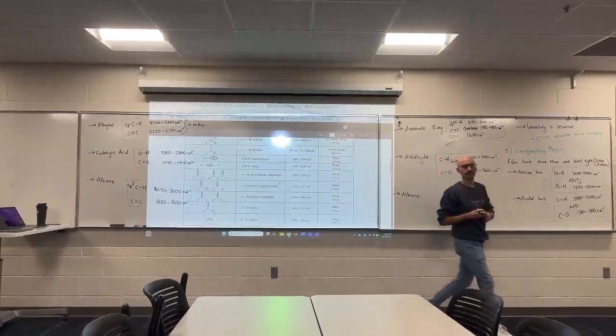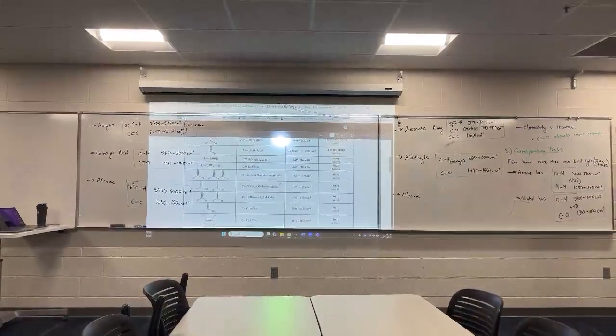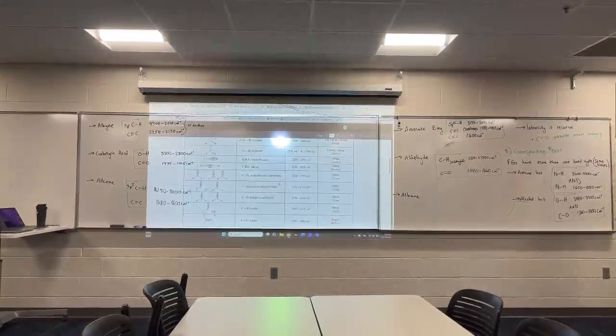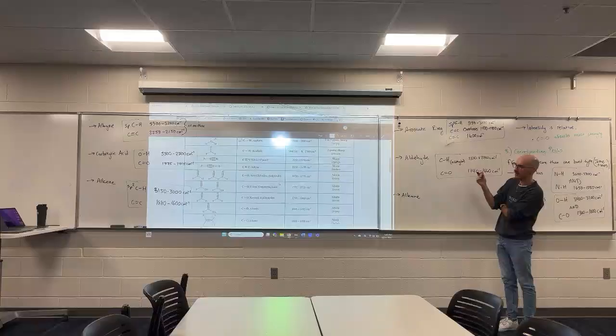But yeah, of course. So are you specifying that it's an aldehyde and not sp2 because it has those twin peaks and that's very distinct? And the range is distinct. Okay. I don't want you to confuse it with the aromatic ring. Maybe it's just the exposure I've had to this.